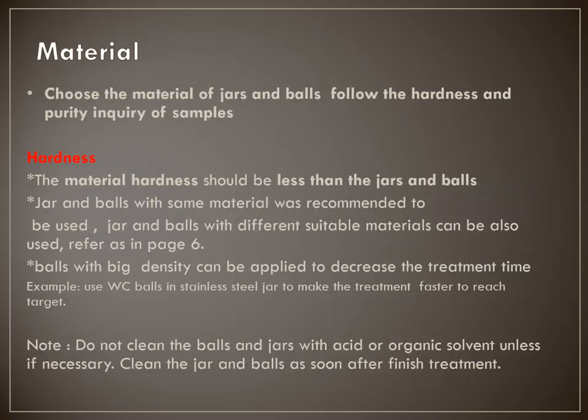About the materials of the jars you select, you have to be very clear about the hardness of your materials, because this hardness relates to the jar materials and the ball materials that you are going to use.